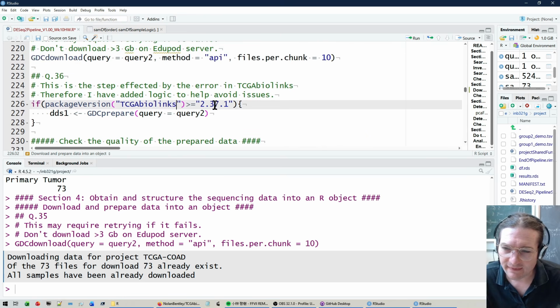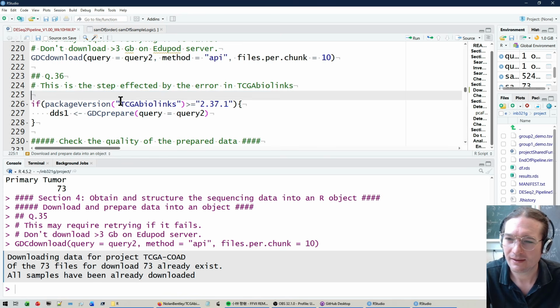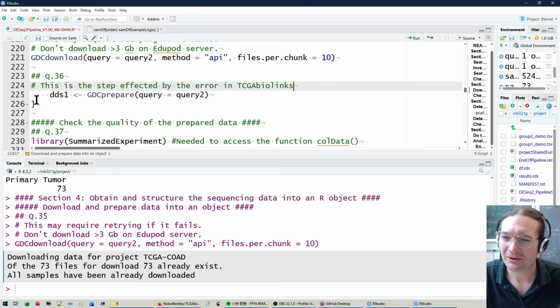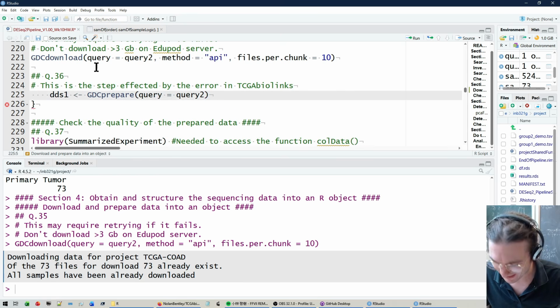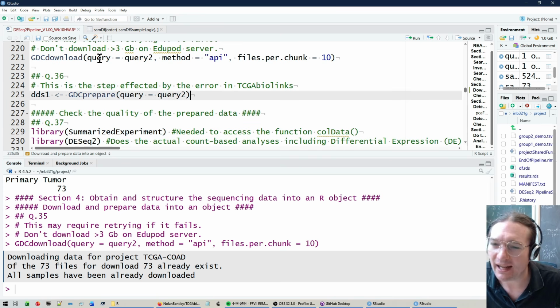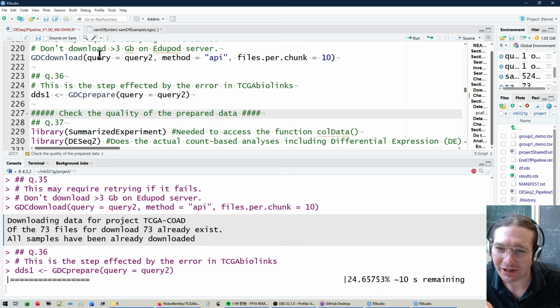Finally, we're getting to the step that is the actual problem. You can see I even checked for the version here. It doesn't work right now. I'm just going to remove that for now because it doesn't matter. I will probably add it in if I manage to fix it, but if not, then it doesn't matter right now. Frustrating.